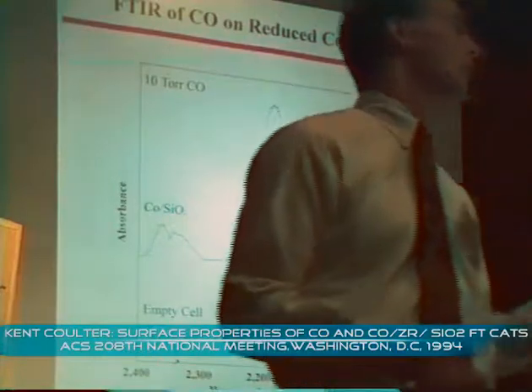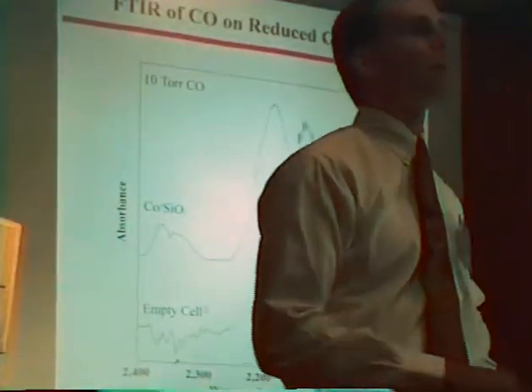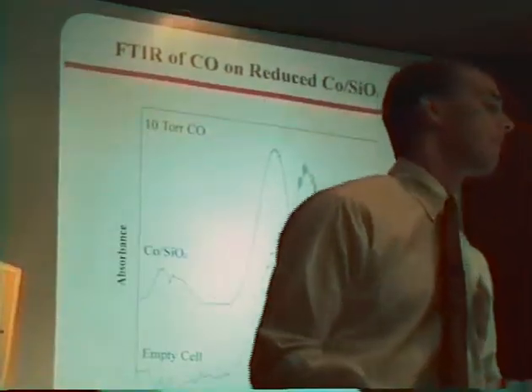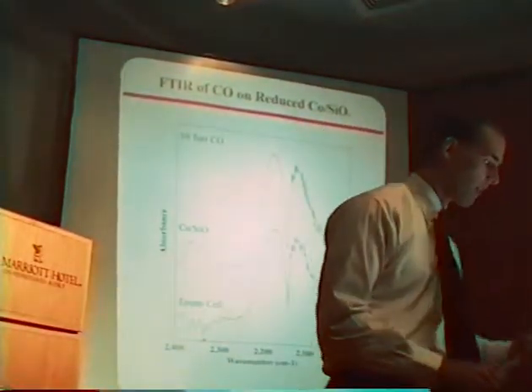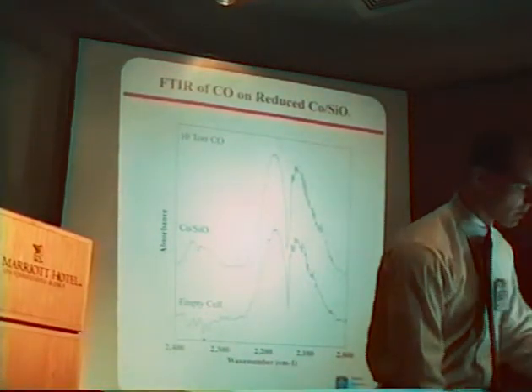This is supported by XPS analysis of these cobalt on silica catalysts following exposure to CO. We see an increase in the amount of adventitious carbon on the surface of these catalysts. So what it suggests is that we do see a large amount of dissociation occurring on the surface of these catalysts.